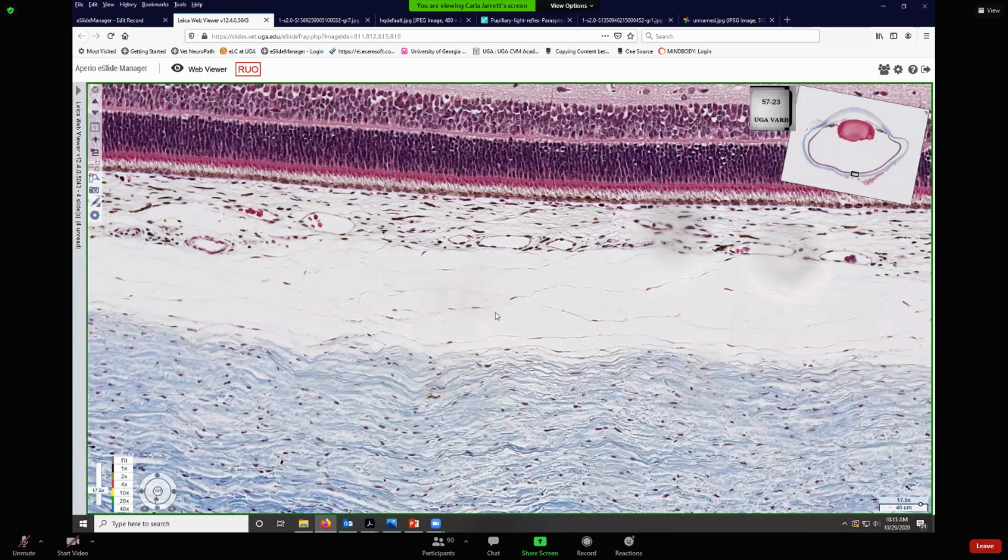It's called the suprachoroid layer. And it's really where this artifactual space occurs, where this artifactual separation between the choroid and the sclera is, that suprachoroid layer. I have no idea why they named it. Rather silly, but they did.